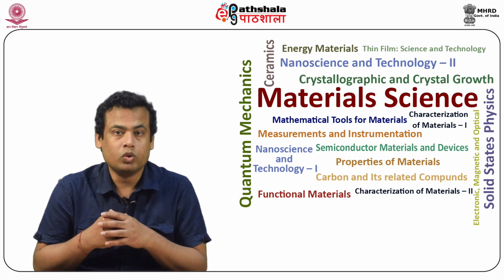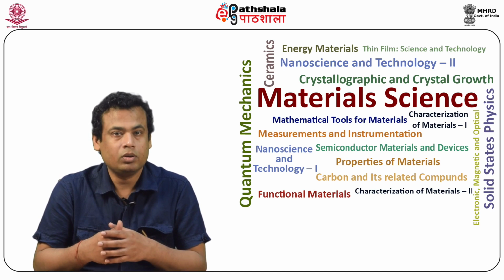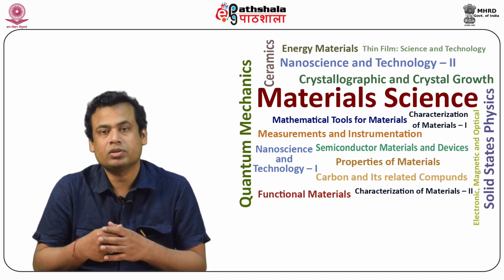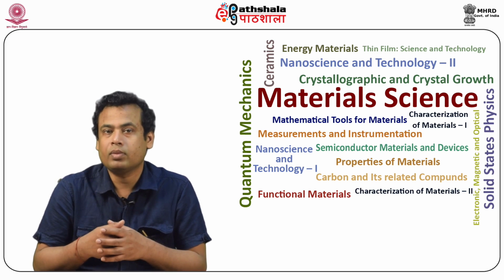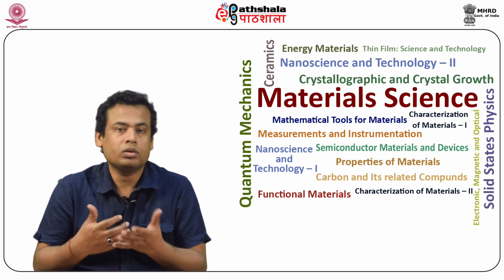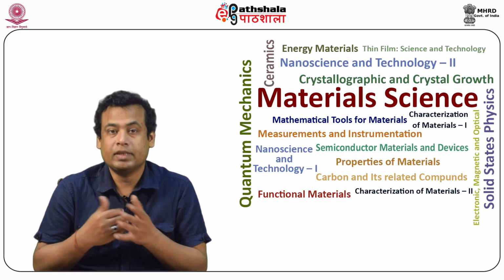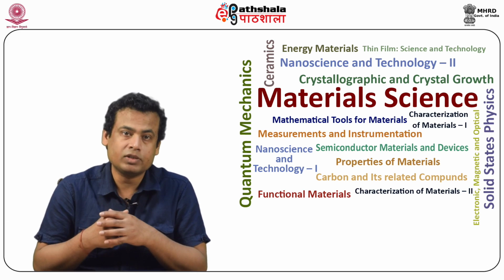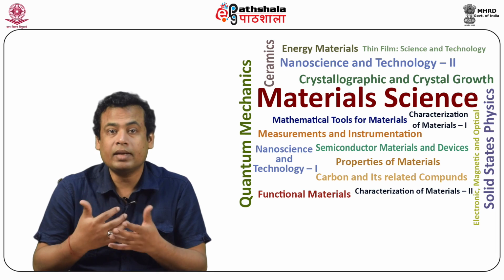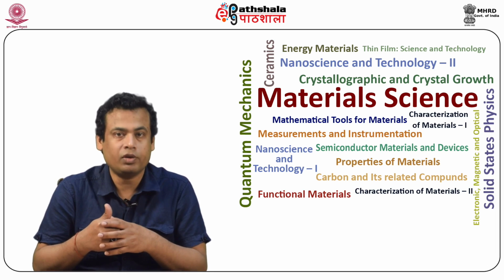The electron source in the microscope generates a beam of coherent electron waves, which, when falling on the surface of the specimen, interact with the atoms of the specimen and can form beams consisting of either coherent or incoherent scattered electrons. The electron beam generated from the thermionic electron gun passes through the electromagnetic lenses and is directed towards the column of the microscope and falls onto the sample surface.